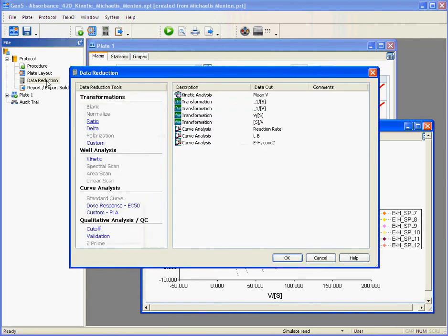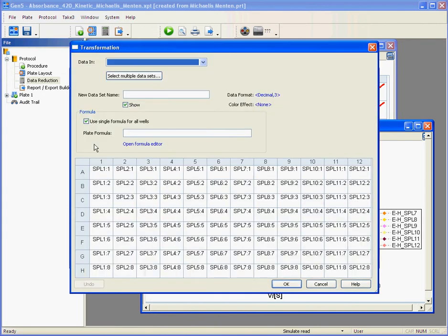If you open data reduction and create a custom transformation, what you can see here is a link that gives you access to a new formula editor.